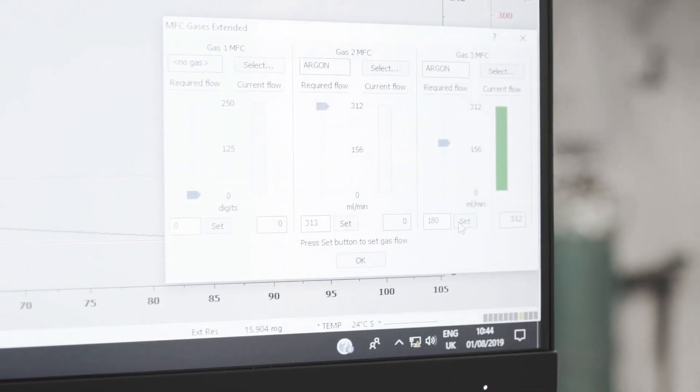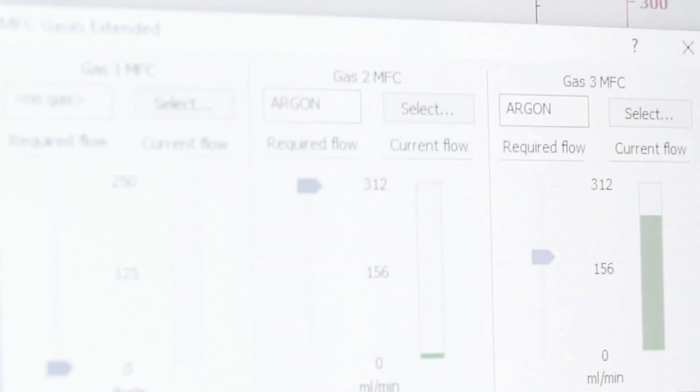So what we have here is a NETCH skimmer. It is a thermal analysis unit. It does thermogravimetric analysis and differential scanning calorimetry.